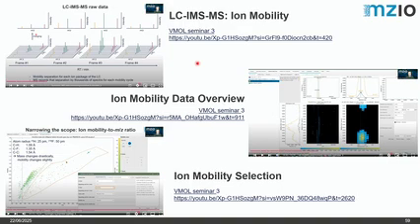And I think with this, we will start into the live demo. And for that, I will hand over to Robin. Hi, I'm Robin, and I'm back.